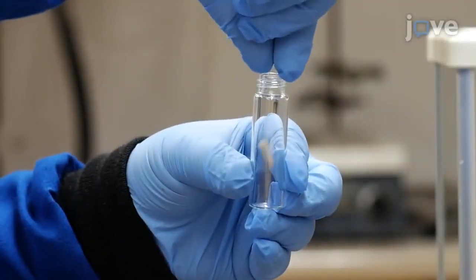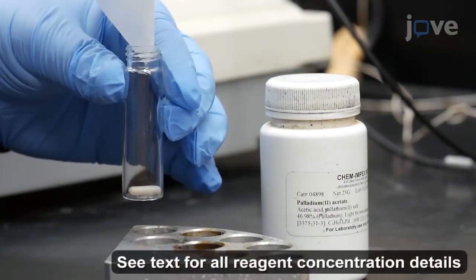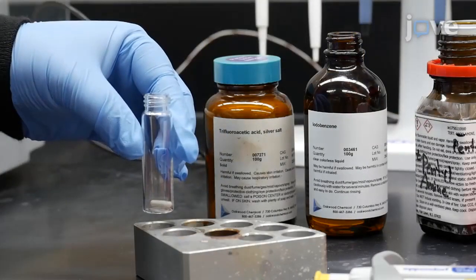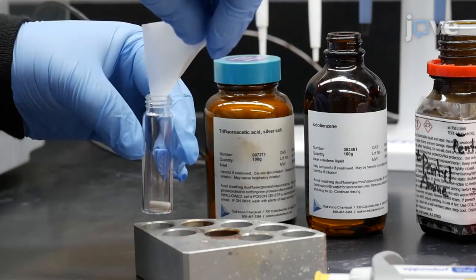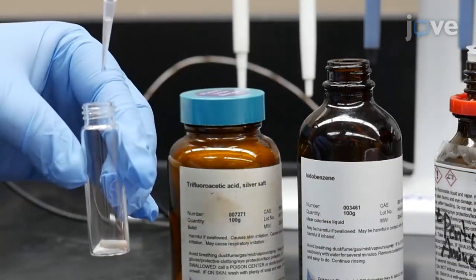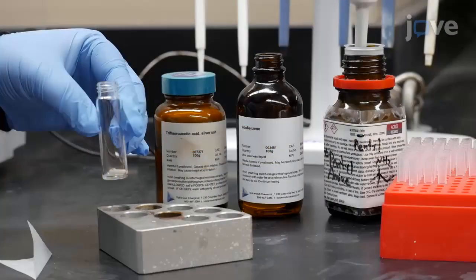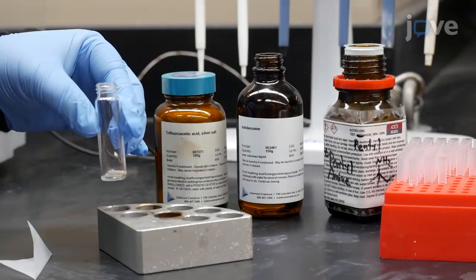To begin, add a stir bar to a dry 7.5 milliliter vial and add 6.7 milligrams of palladium acetate to the vial. Next, add 99.9 milligrams of silver trifluoroacetate, 92.3 milligrams of phenyl iodide, and 26.3 milligrams of tert-amylamine to the vial.